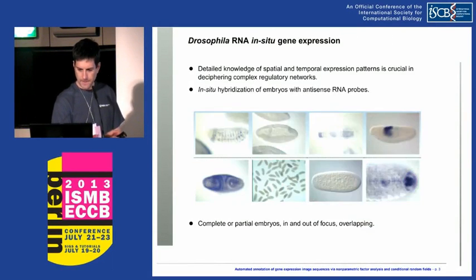Going back a little bit to high-dimensional data, we used a similar protocol to the one introduced by the previous speaker, whom I would like to thank. We used RNA in situ hybridization. This time we had images from Drosophila embryos. I'll get into more details about acquiring those images, but I would like to point out with this slide the complexity of our data.